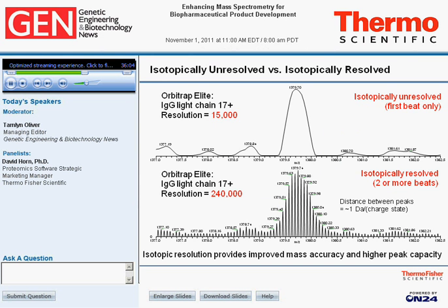I want to point out, for those of you who are unclear, the difference between isotopic resolution and the advantages of having isotopic resolution versus being unresolved. This is an artificial experiment where we ran the same sample at 15,000 resolution, which means we detected the transient for a shorter time, as well as at 240,000 resolution, which means we detected it for longer. As you can see, the longer we detect, the more confident we are in the frequencies of those various isotopes, and then we can start to resolve them easily.